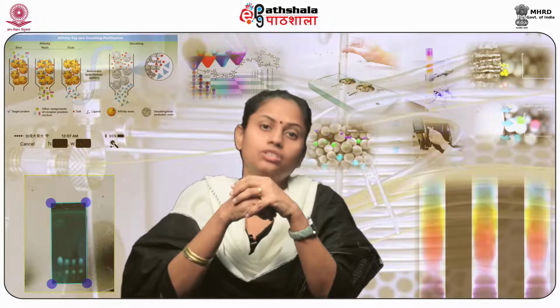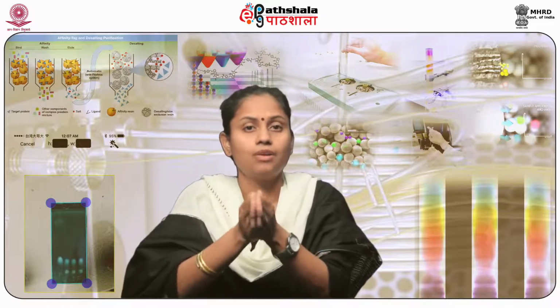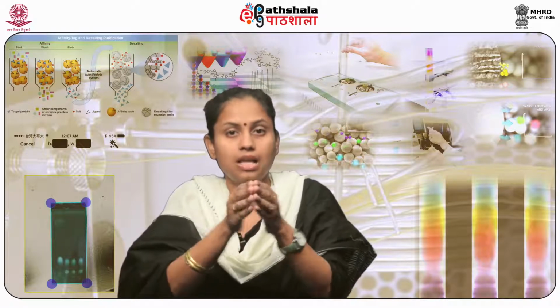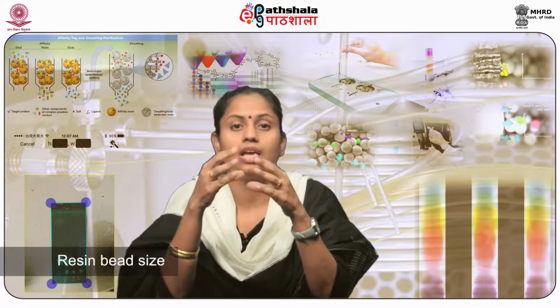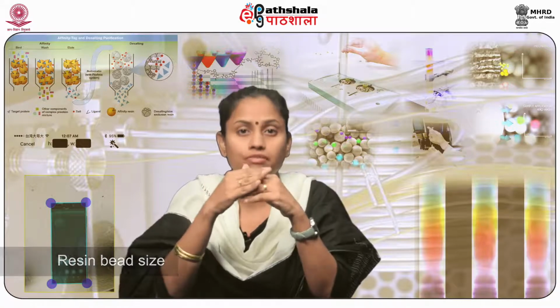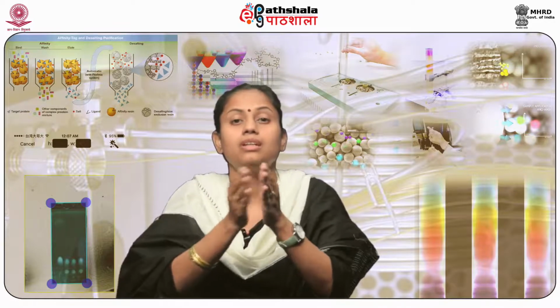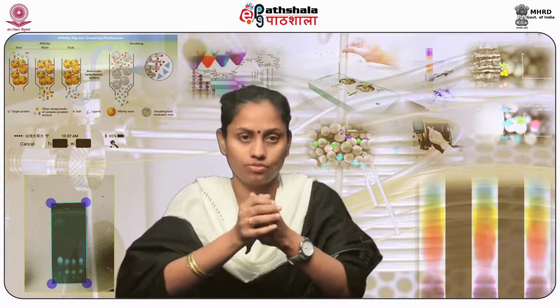Now, the various properties of the stationary phase that affect ion exchange chromatography include the surface area of the stationary phase, that is, here we are talking about the resin bead size. As the resin bead size decreases, the surface area per unit volume increases, thereby providing better separation of the compounds.